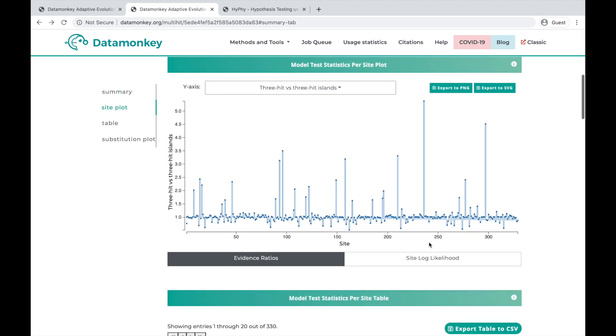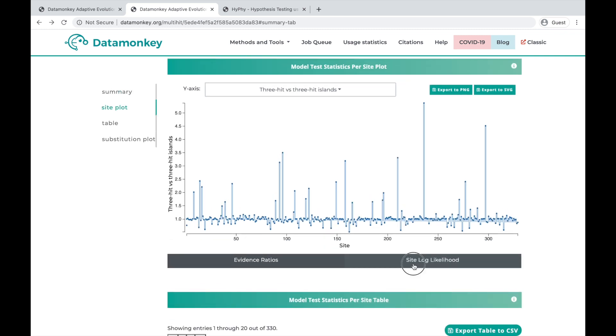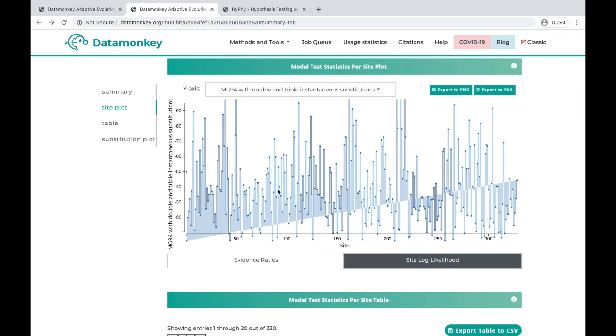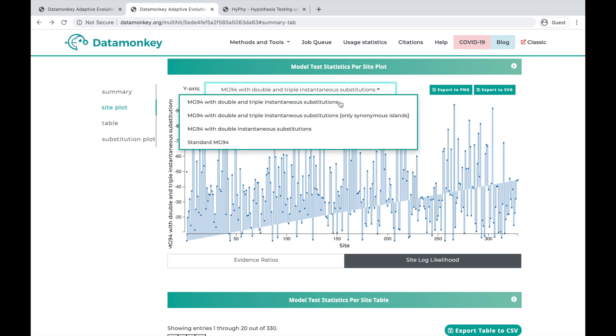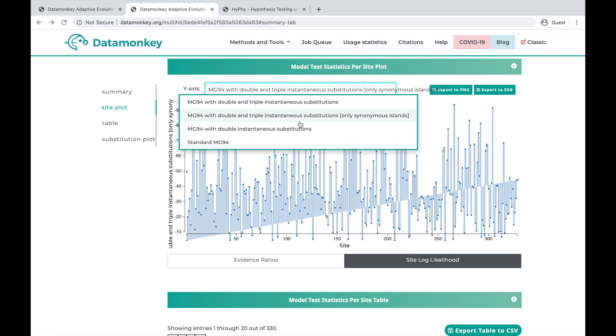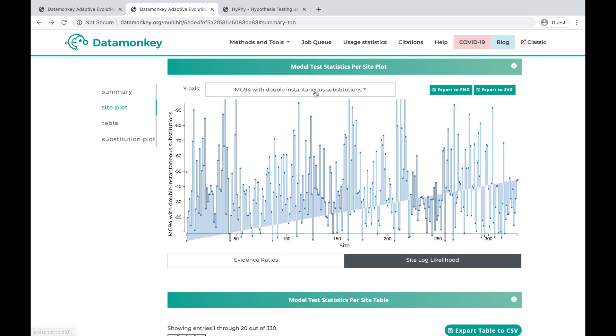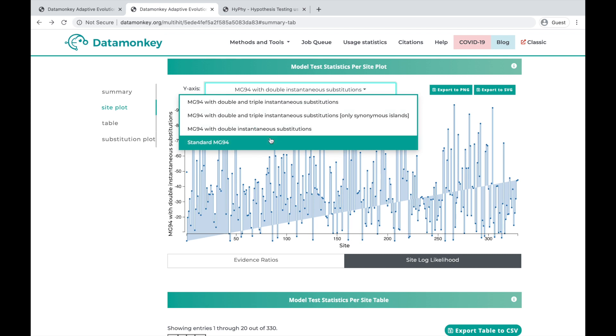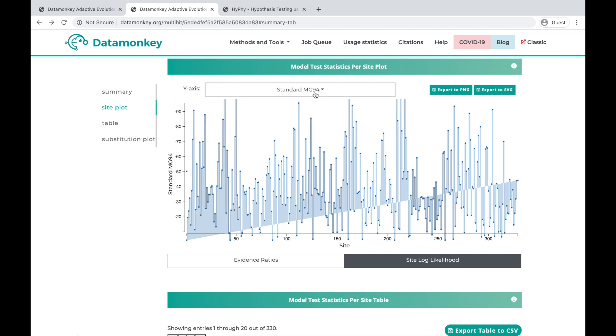We can also plot the site log likelihood on this graph for each of the models that was fit to the data, and we see how this changes slightly based on the model we choose.